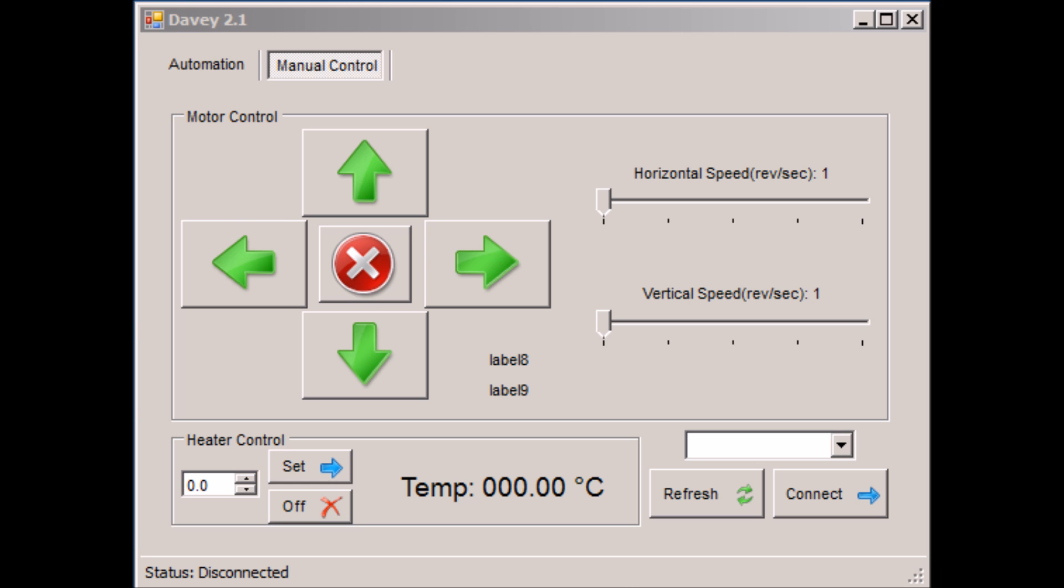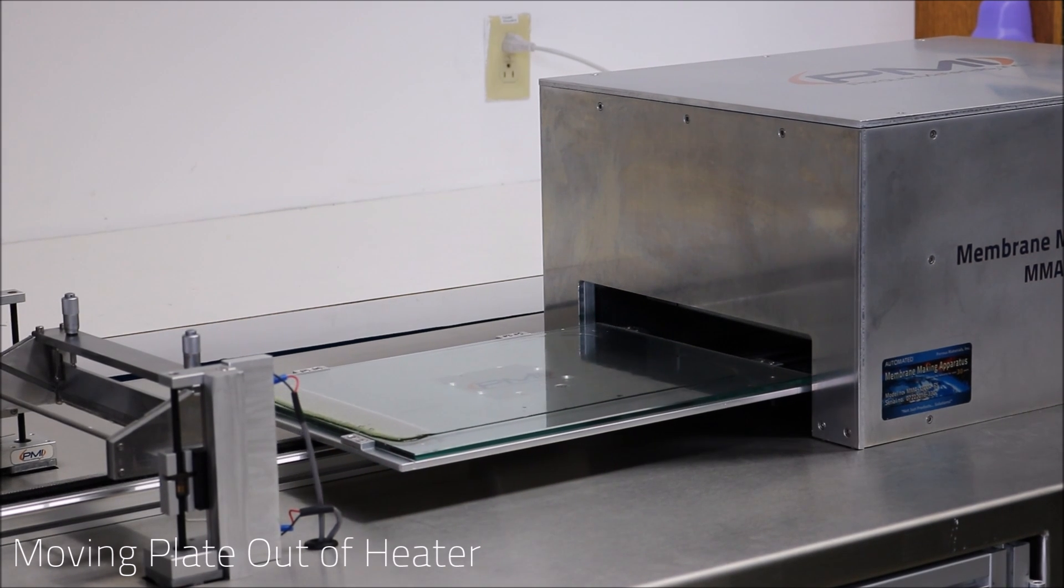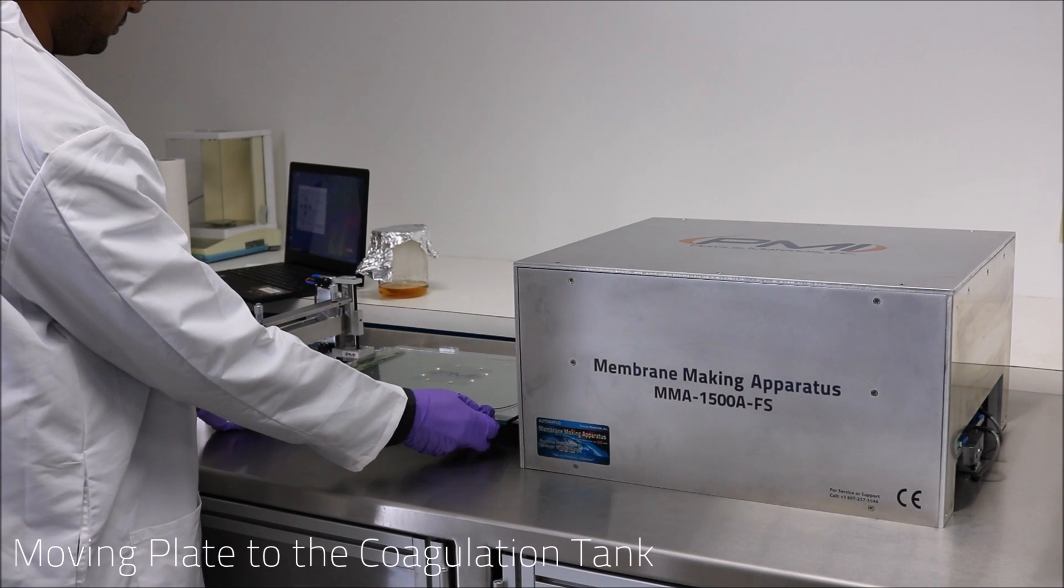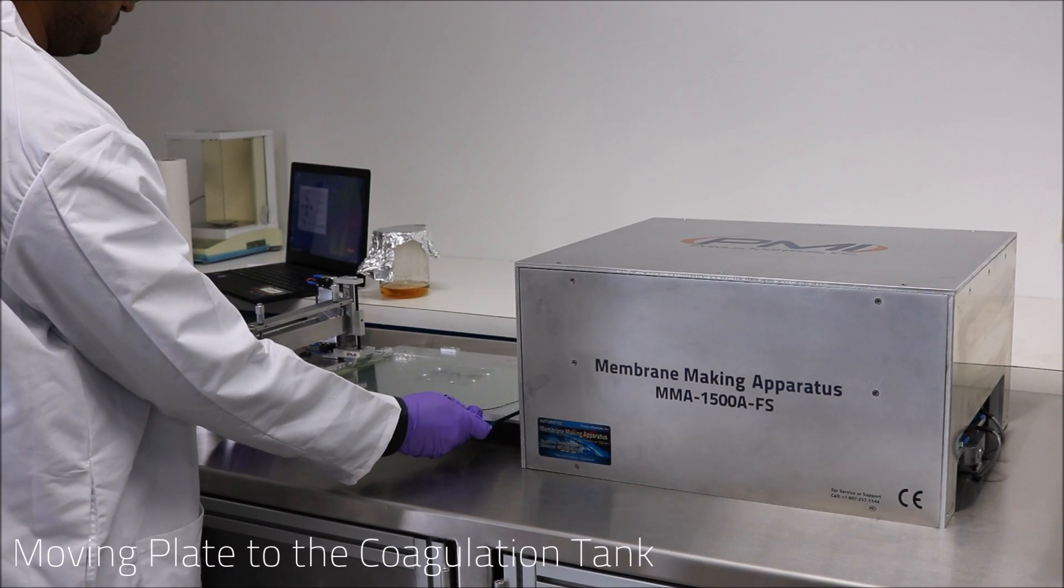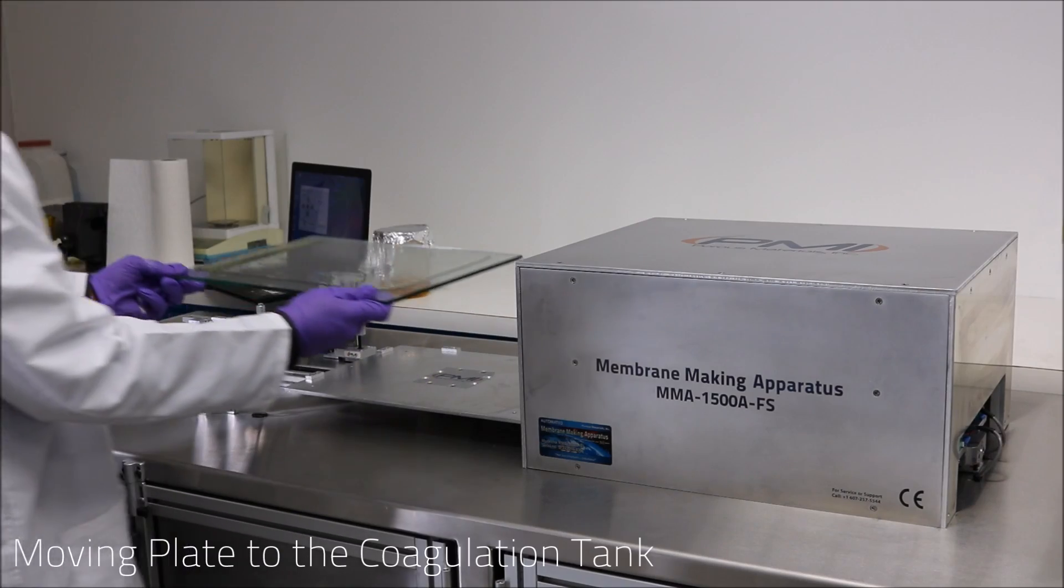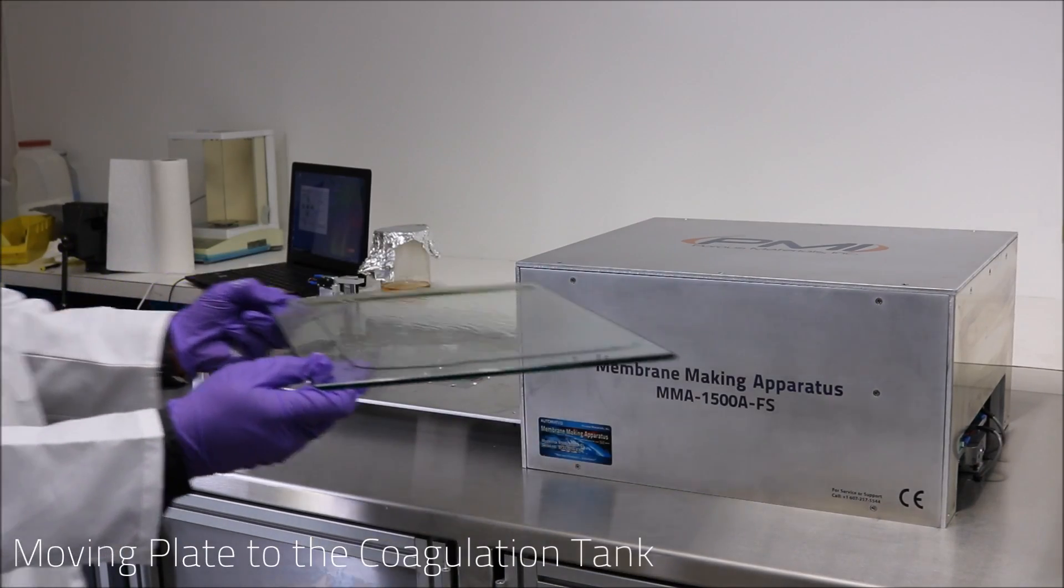Next, we will back the membrane casting plate out of the oven and allow it to cool. After the plate is cool enough to handle, firmly grasp it around the outer edges and transport it over to the coagulation tank.